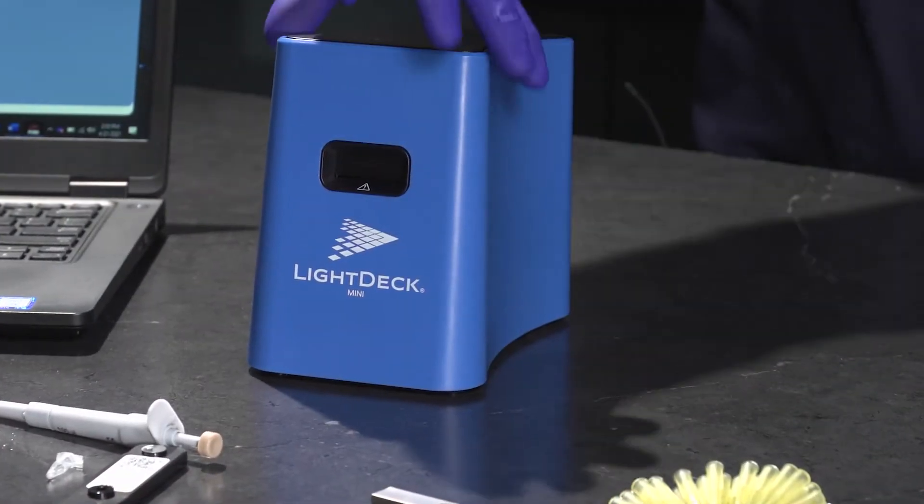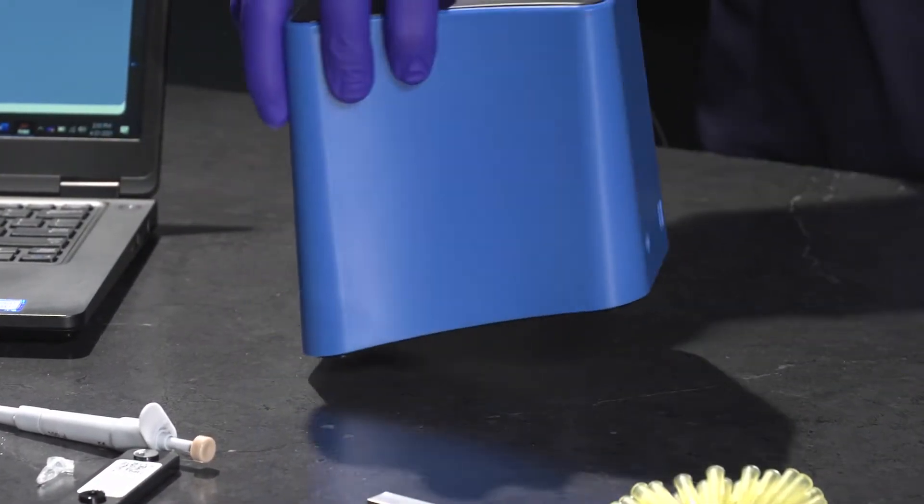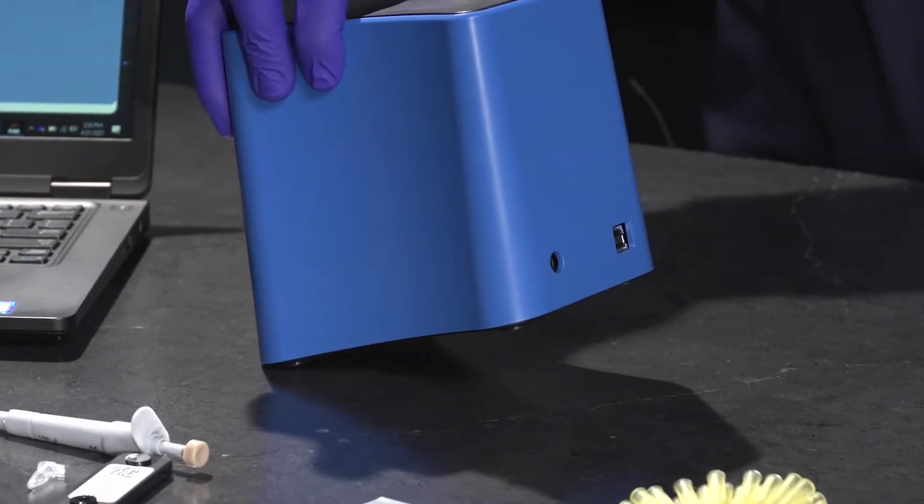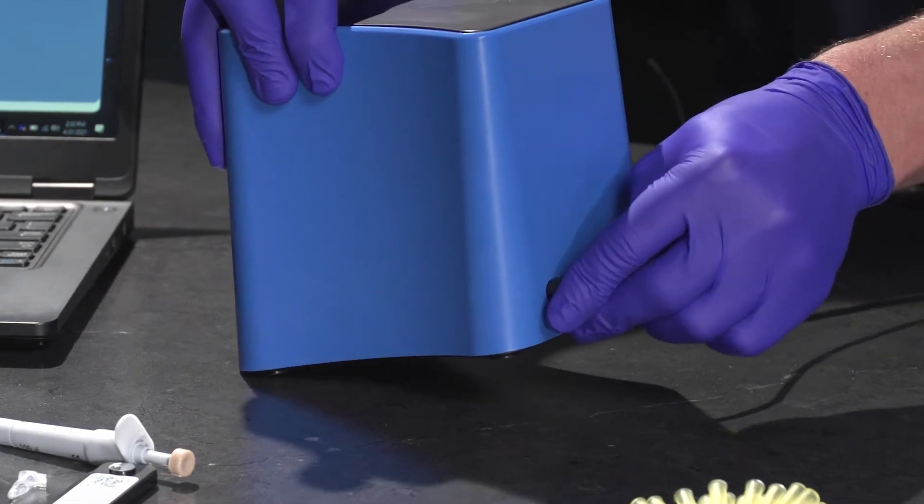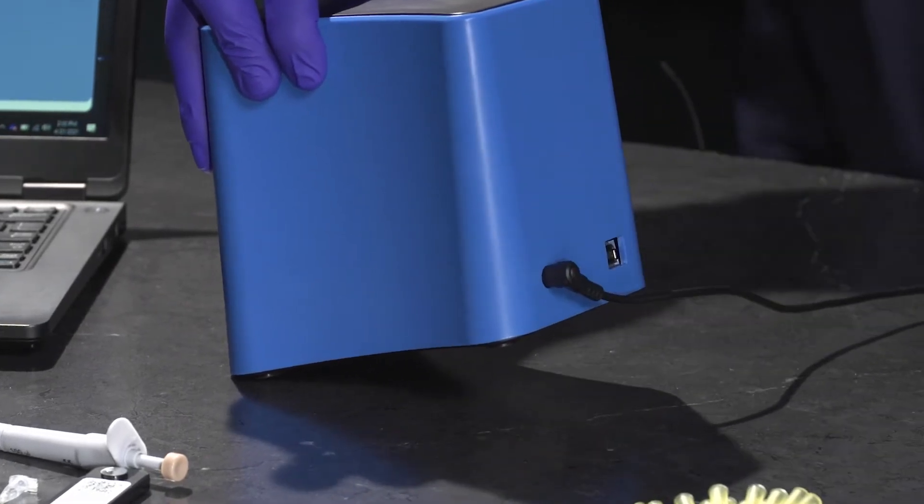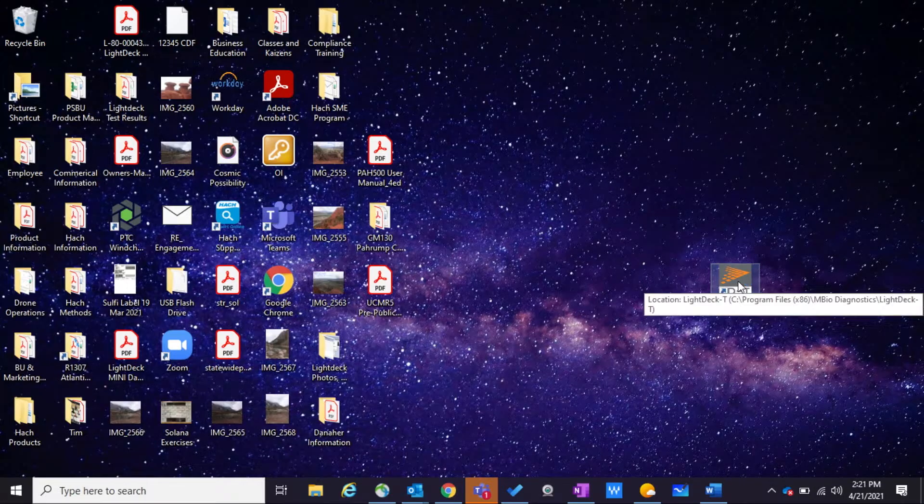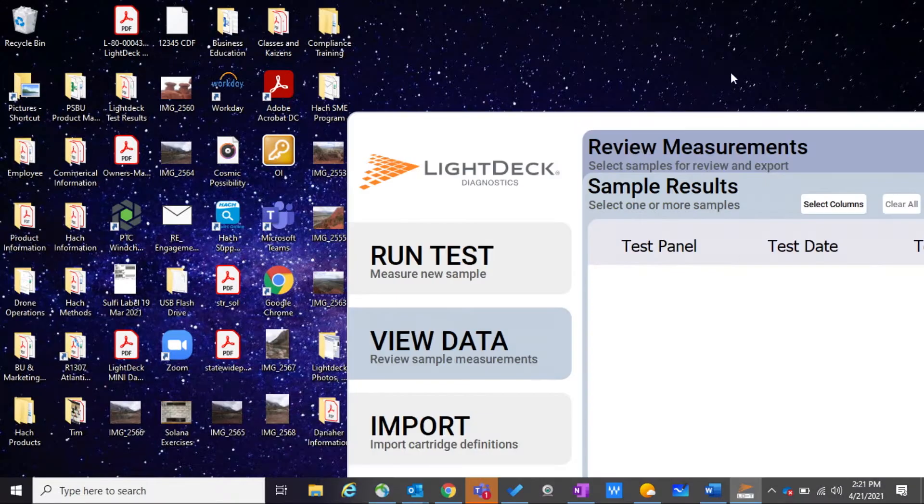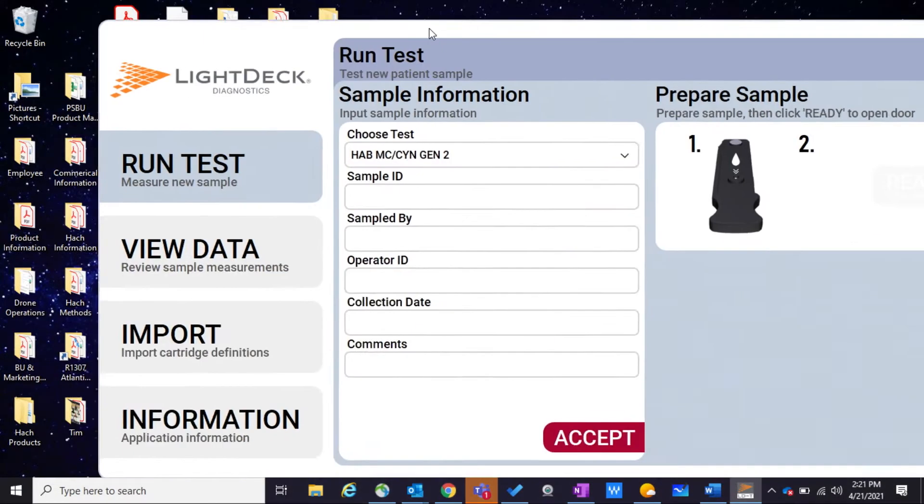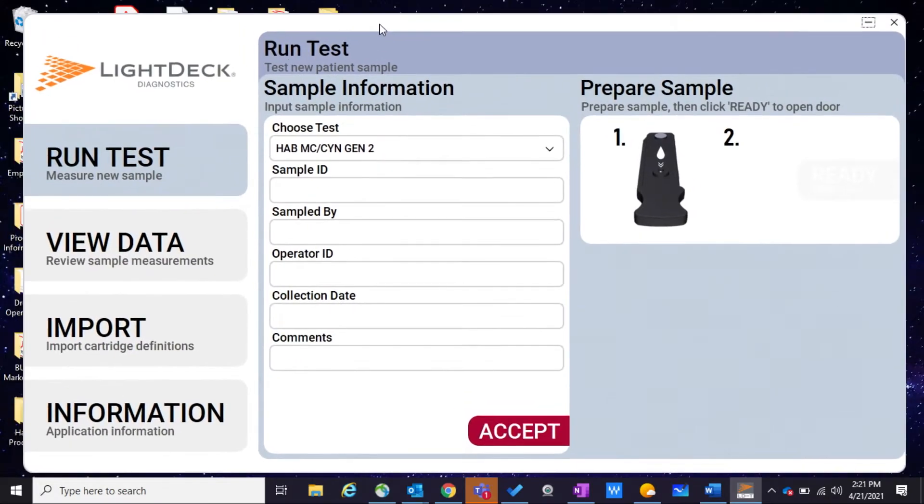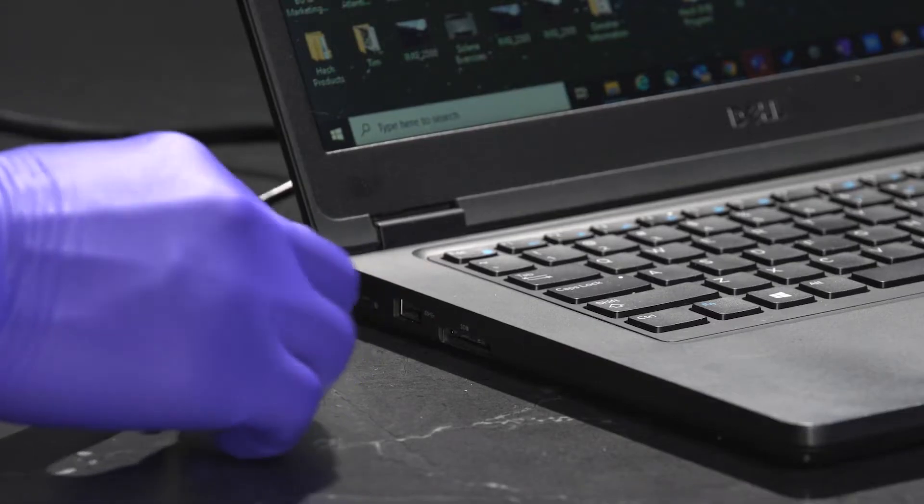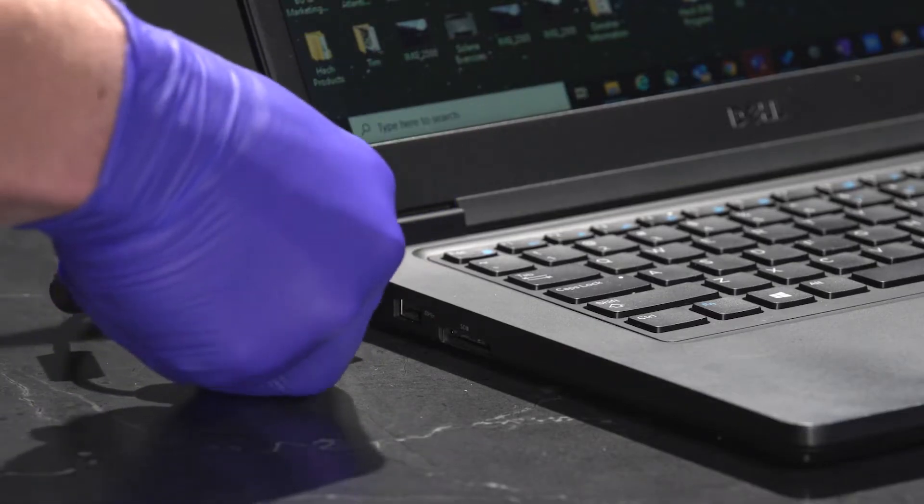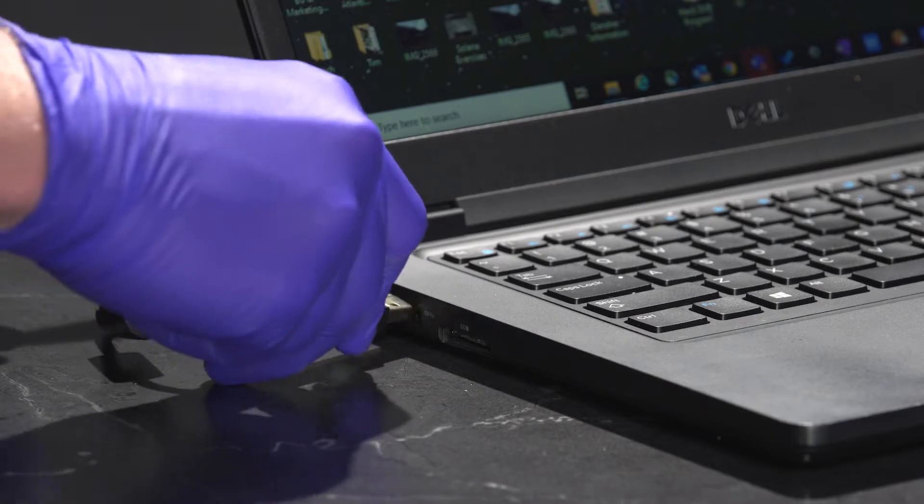Before preparing your sample, please ensure your LightDeck Mini is plugged in using the included external power supply. You will also need to install the LightDeck software on your Windows computer and connect your computer to the LightDeck Mini using the provided USB 2.0 cable.